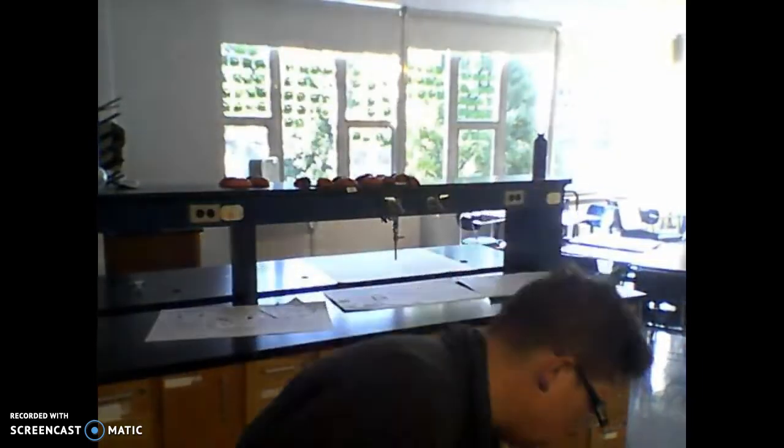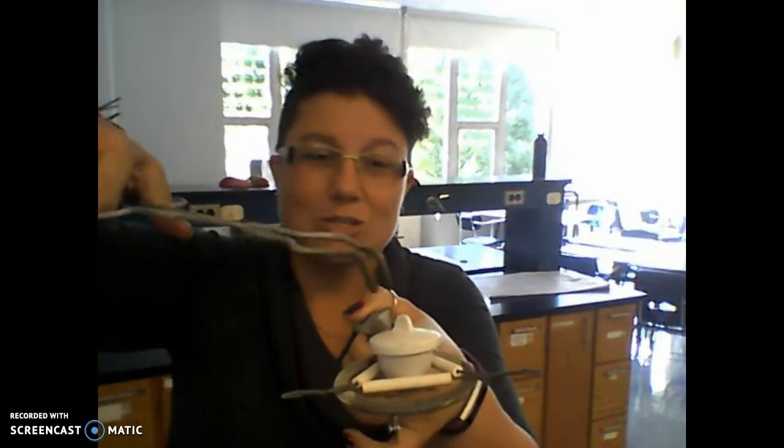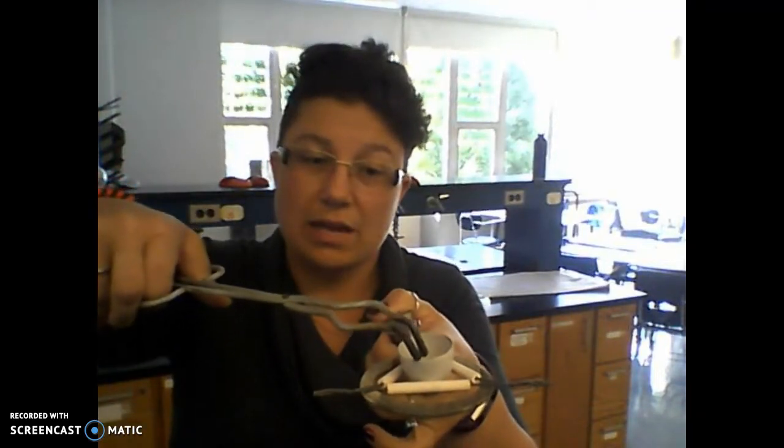These are your tongs — technically called crucible tongs. When you're heating something up, there's a hole designed so you can come in and scoop out the crucible without ever touching it. Another method is to use the pinchers to pinch the lid, pull it off, set it down, then pinch the inside of the crucible to grab it. We try to avoid that second method because of cross-contamination, but it is another option.